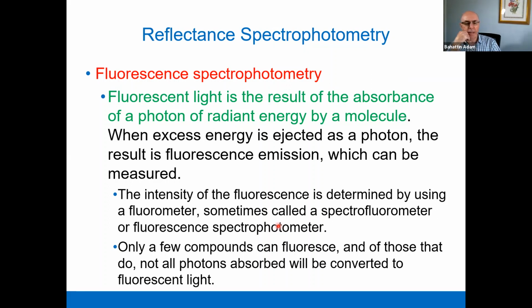It is limited to compounds able to fluoresce. Otherwise, you cannot use the fluorescence spectrophotometer.